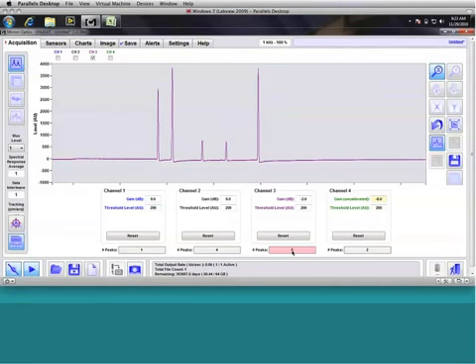So there is a communication that's established between ENLIGHT and the dynamic interrogator to contend with either sensors dropping out or spurious peaks coming in and disrupting the order in which sensors are detected. And so we're going to go through a little demonstration here of this peak tracking communication between the instrument and the application and how that's used.